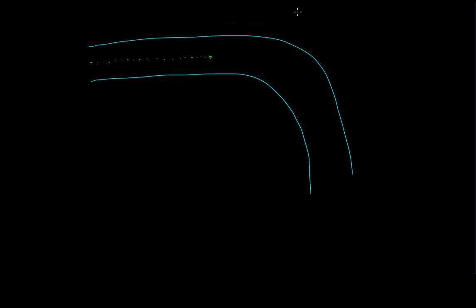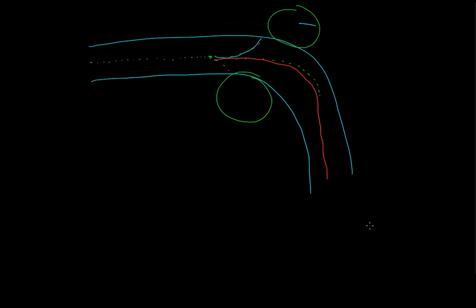Now, if we have magnets here and here, we can change the charge of these magnets so that we can alter the path of this ion. So it could go, if this magnet is too strongly negative, it will fly off and hit this wall, and that won't be good. If it's just right, the balance, then we can aim it down here and we'll get it into the detection chamber. Or if it's this one is way too negative, we'll just end up crashing into the side here.